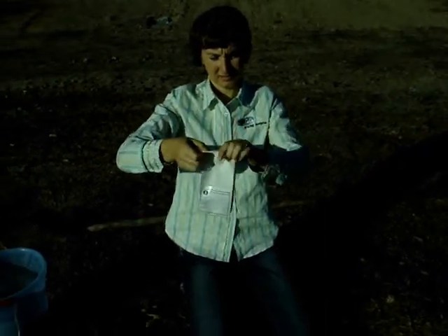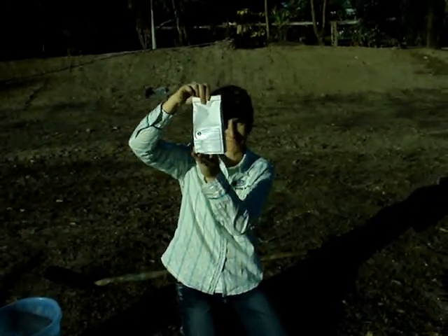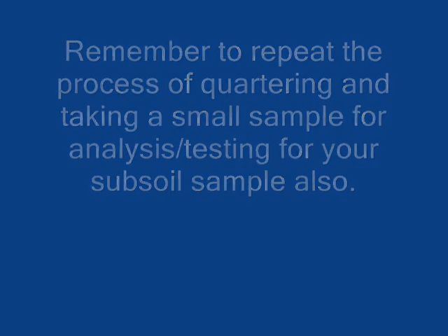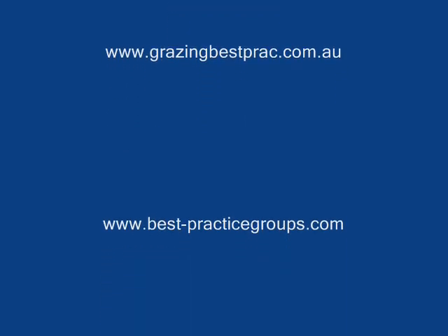That's about all we need. Now we fold the bag down like so, and put your pre-packaged soil sample in a box to send off to the laboratory. That's how you want to fold it.